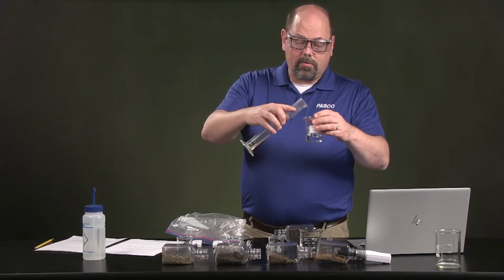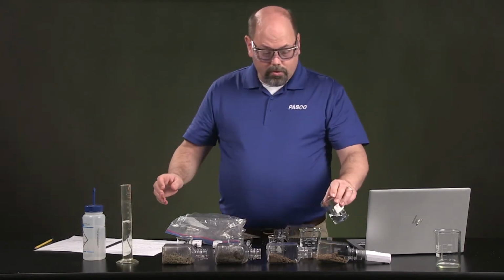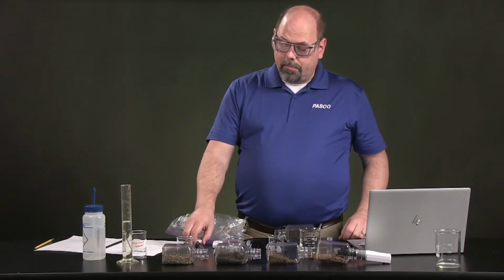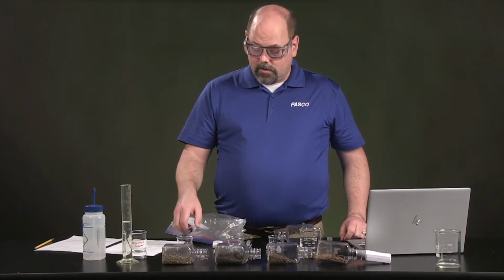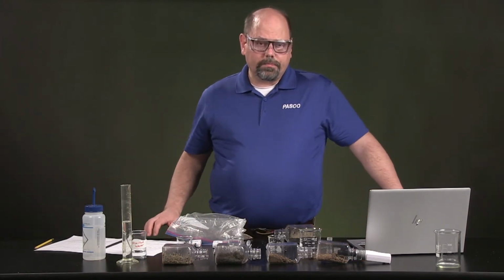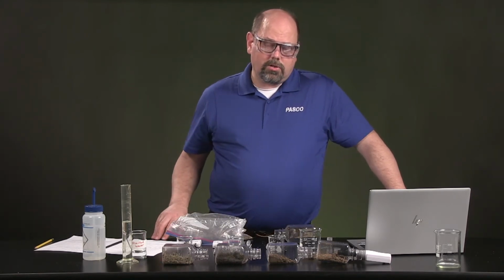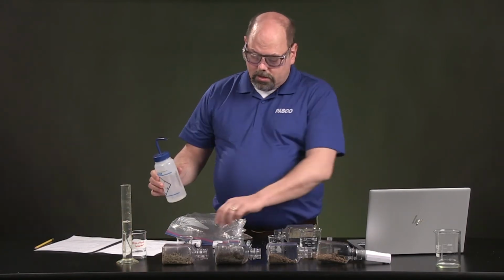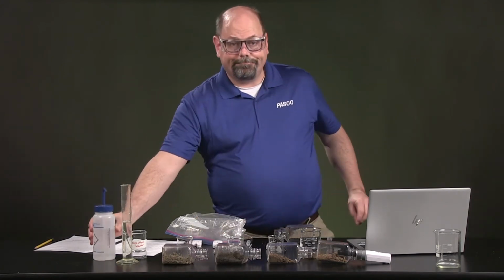So that should be about equal volume as what you started off with in terms of your water. And we're going to pour those into each of these substances to measure the pH change with that pH sensor. So first time through, you're measuring just the pH of the solution to see if there's substances dissolved in the soil that are going to change the pH from neutral, 7, and then next you're going to add the acid and remeasure each of those again. Between each, you're going to use the distilled water to rinse the bottom off, and we'll show you that in the collection phase.